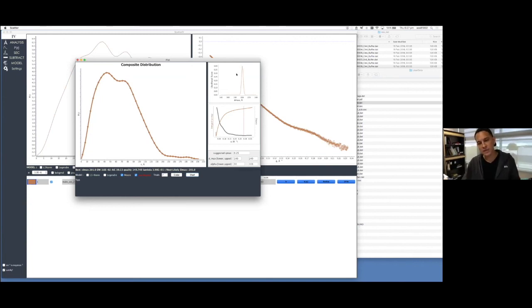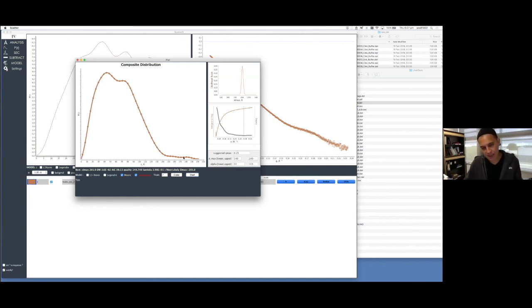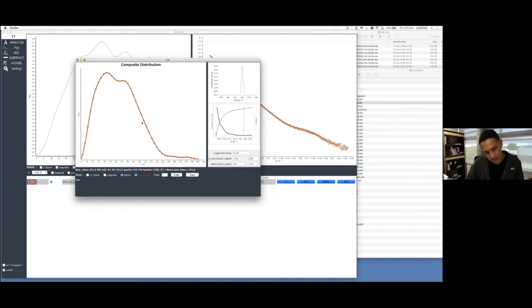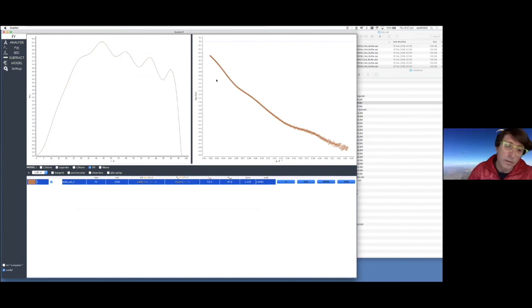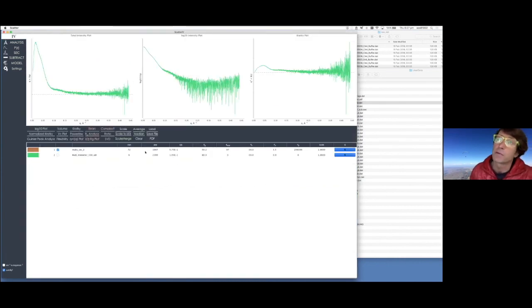The likelihood score peaks at about 200, telling you roughly where the D_max should be, and the P(r) distribution looks something like that. It has a longish tail, probably because it has some flexible bits that aren't quite compact — normally for a really compact particle it just drops straight down to baseline.